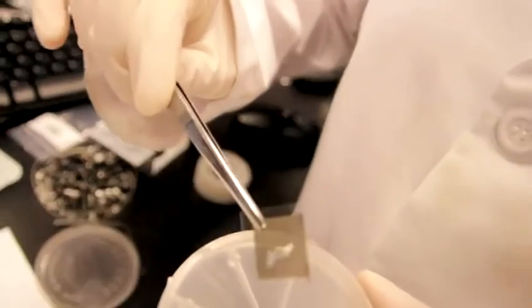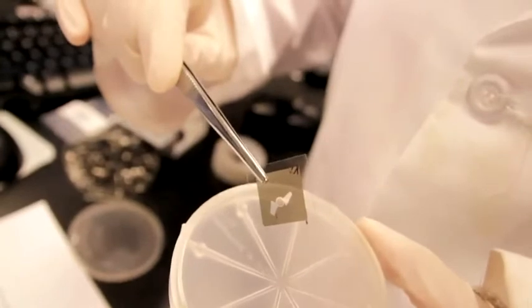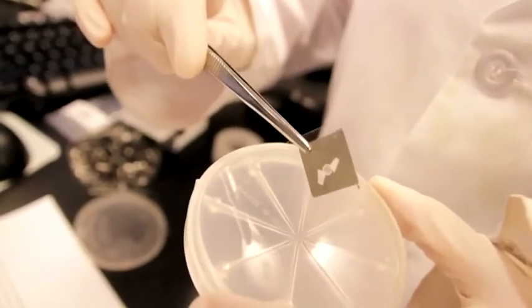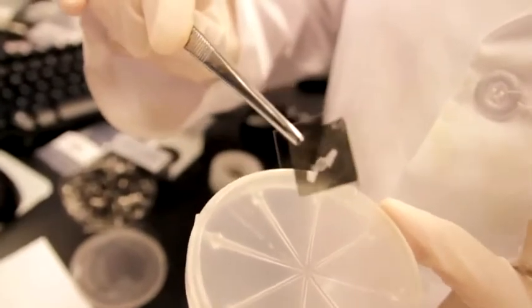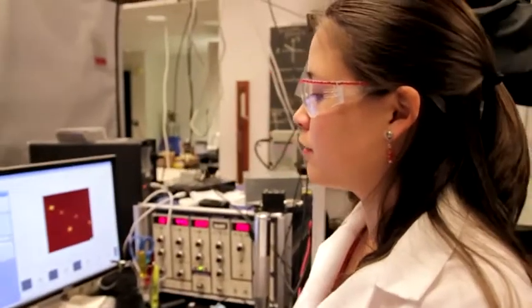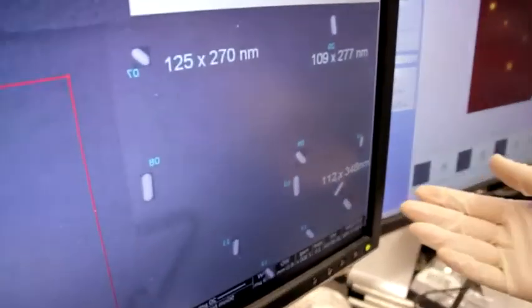I'm going to demonstrate this with some of the nanostructures we discuss in our article that are the easiest to identify in both electron and optical microscopy. On this sample, we have gold nanorods with widths ranging from 80 to 130 nanometers, and lengths ranging from 250 to 500 nanometers.